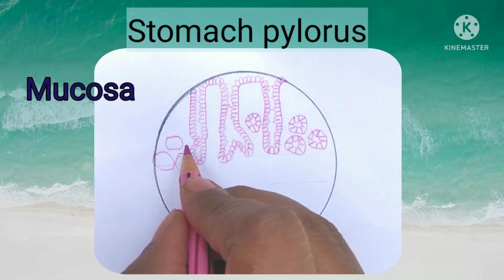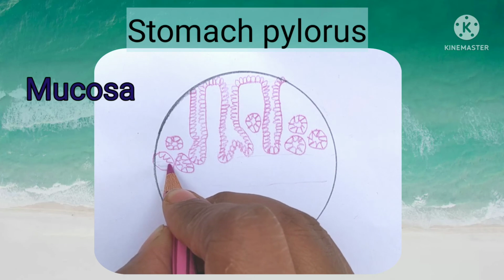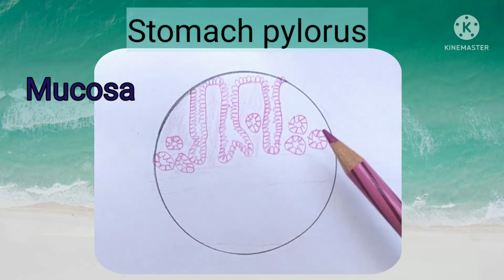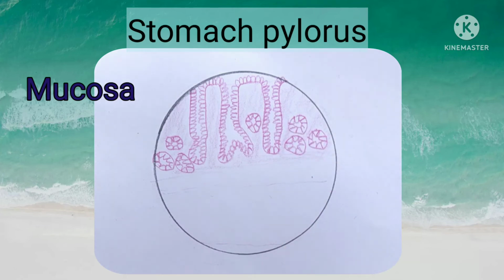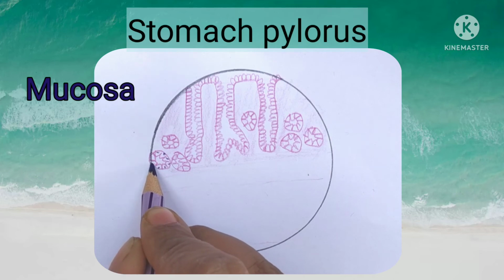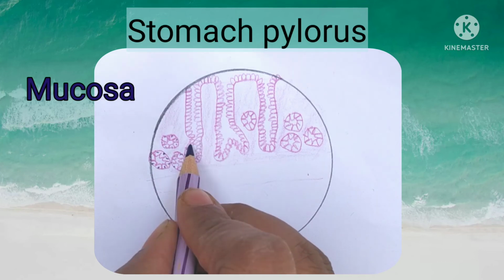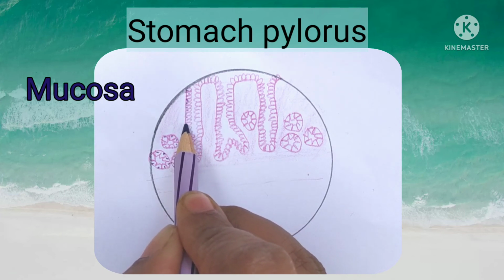Apart from these cells, they also contain enteroendocrine cells. They are very difficult to distinguish among the others. Only with special stain can they be distinguished. And the stem cells are present near the isthmus, which is the junction between the pit and the glands. So the cells which are destined to produce the surface mucous cells will ascend up. The cells which produce the gland cells will descend down. So all are columnar cells with an oval, basally placed nucleus.